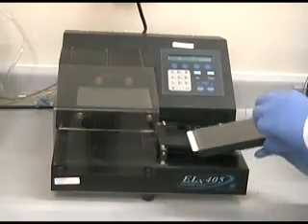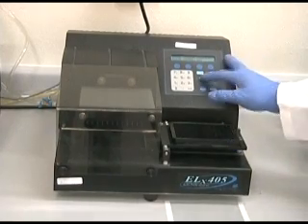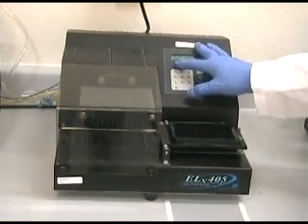Automatic plate washing. Connect the prepared wash buffer to an automatic plate washer. Upon initial setup, run 1 to 2 prime cycles to make sure that the wash buffer is running through the plate washer.